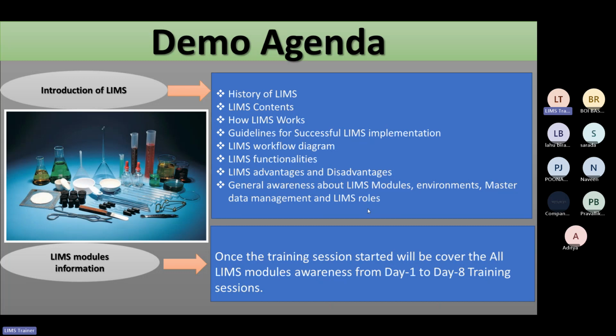While we are going through the course, what we have designed is that I have taken screenshots of the different modules and how we are going to work in that particular software. I will explain slide by slide, when you enter a particular module, how the functionalities will work, how you can utilize that knowledge, and how you can go from validation, software development life cycle, to end user experience. All the things I will explain, but through the screenshots of the software. You will not get real exposure to that actual software, because that is not feasible or not possible.